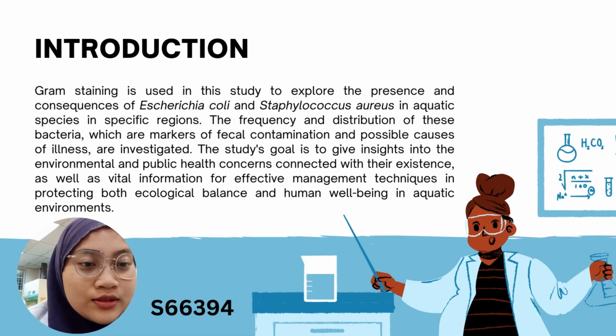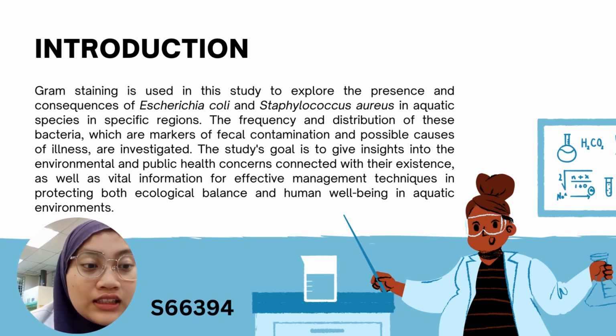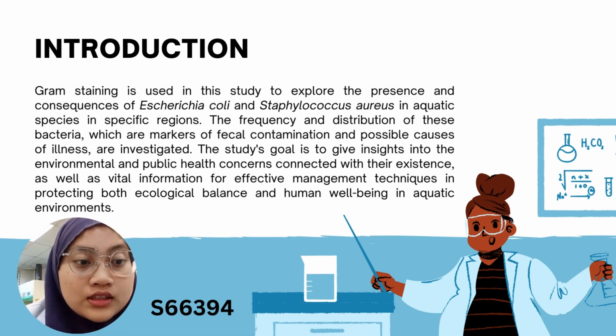Gram staining is used in this study to explore the presence and consequences of E. coli and Staphylococcus in aquatic species in a specific region. The study goal is to give insight into the environmental and public health concerns connected with their existence, as well as vital information for effective management techniques in protecting both ecological balance and human well-being in the aquatic environment.